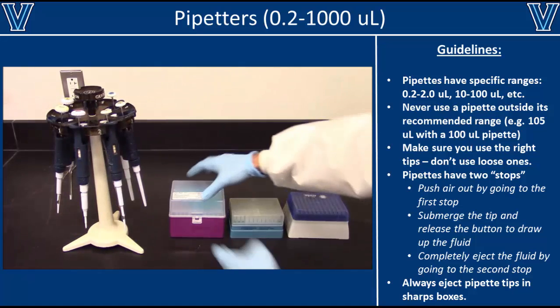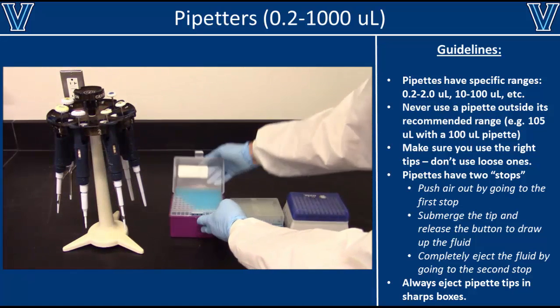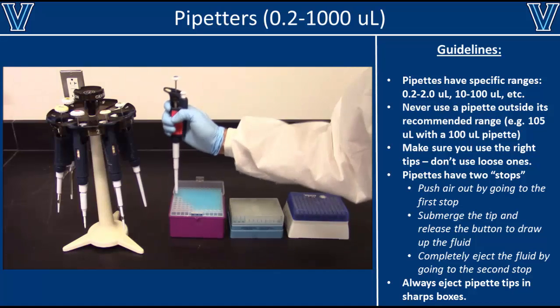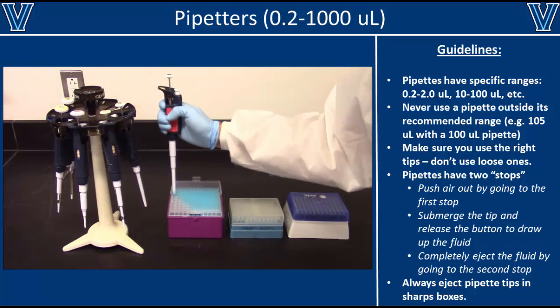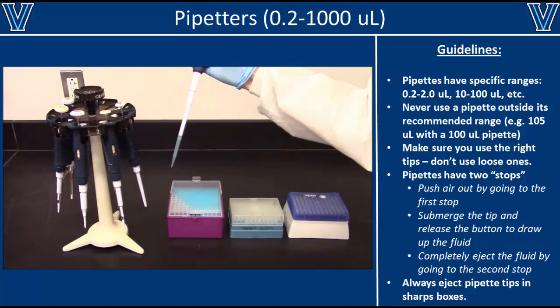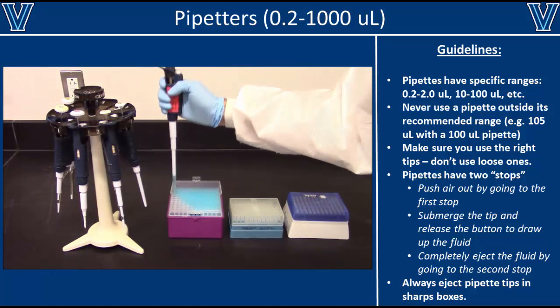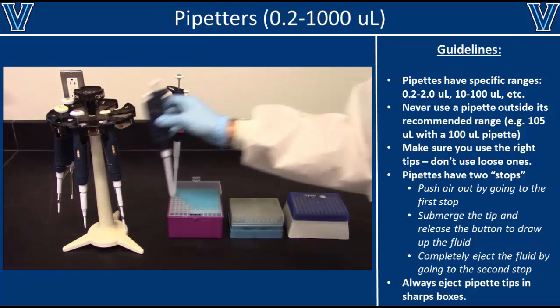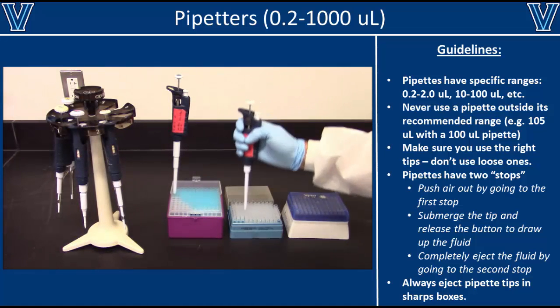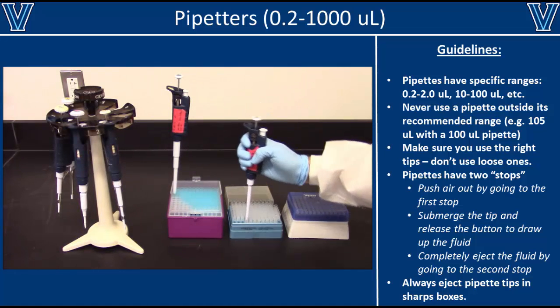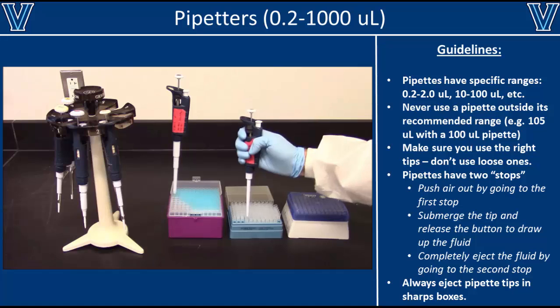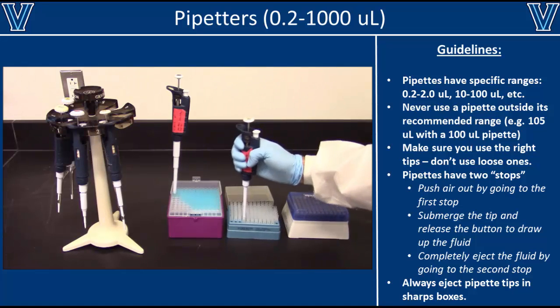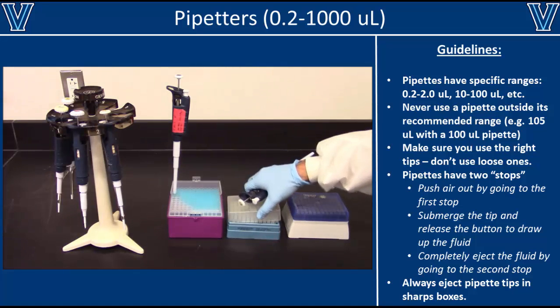Just as pipettes have unique volume ranges, they also require unique tips. For example, this P1000 requires large blue tips. Always make sure that the tips fit on snugly. If the tips fit on loosely or fall off, then they won't work properly and you'll need to find some other tips.